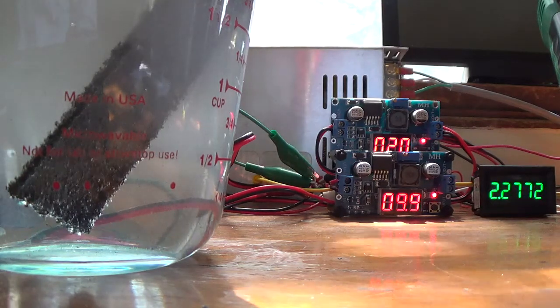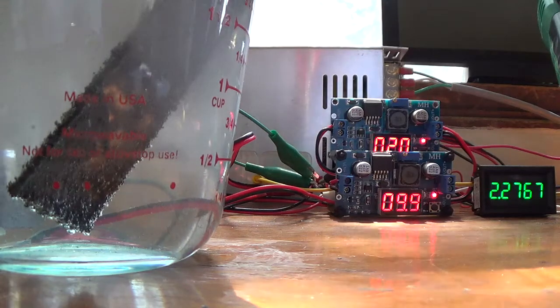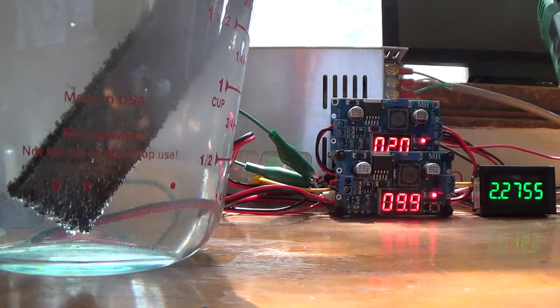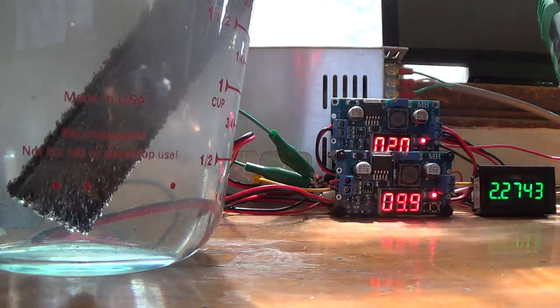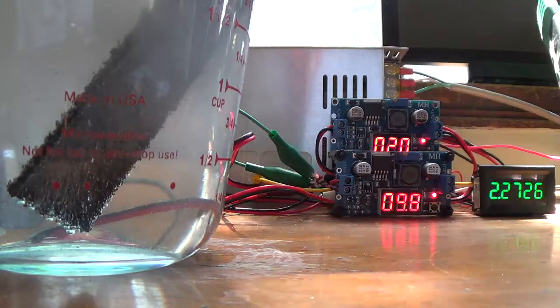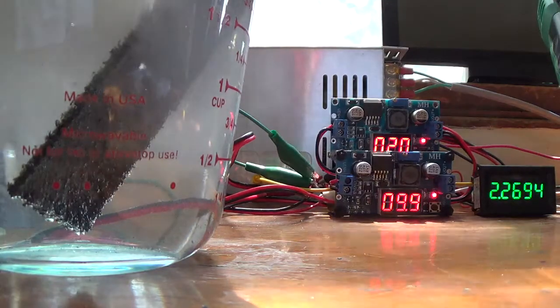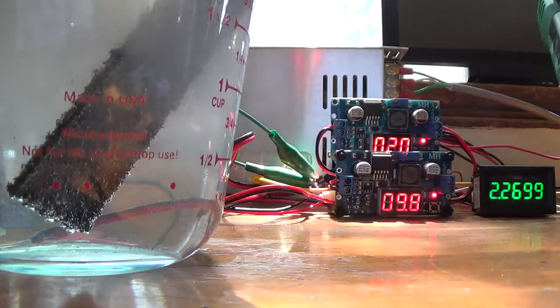The particle size in the raft at the top are more universal, more alike. There's less difference between particles, which is exactly what we'd expect, in that it's not attempting to blow apart the graphite, but rather exfoliate it.